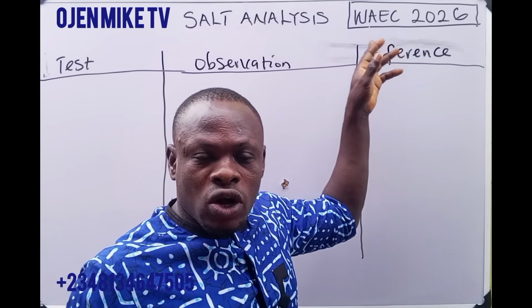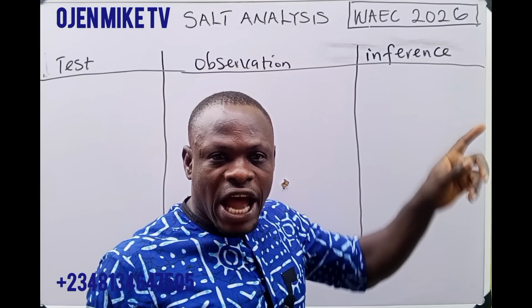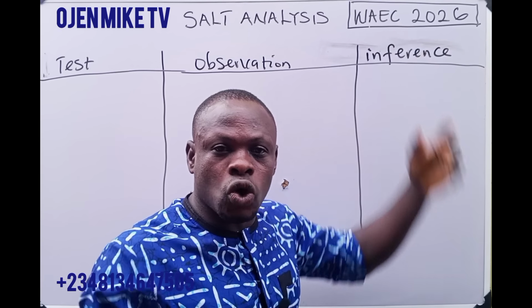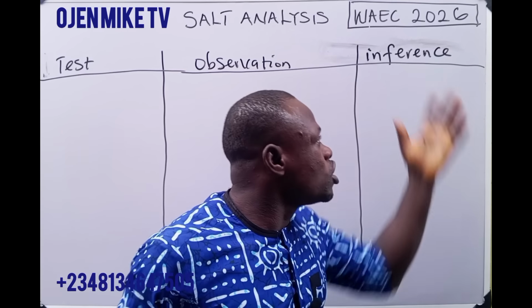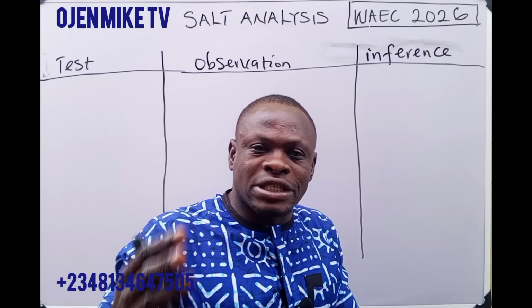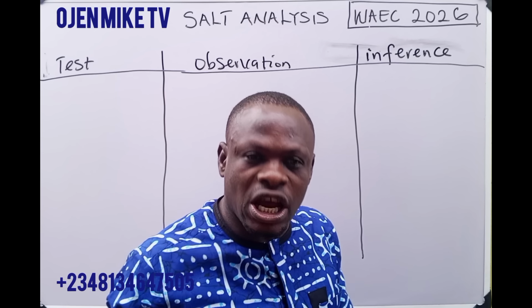Now the first thing you are going to do, remember, the mixture of lead 2 carbonate and starch will be titled C, because they are not going to give you like that. It is only the teachers that will give, they will already know what is there. So that lead 2 will be titled either C or D, as the case may be.